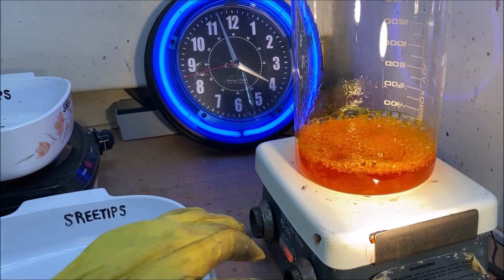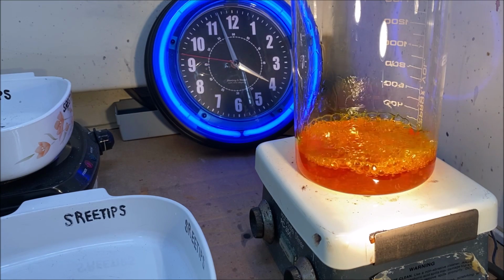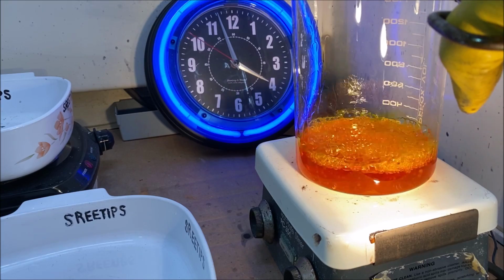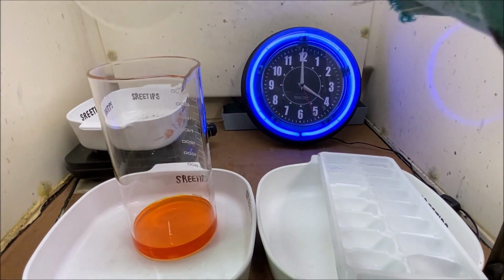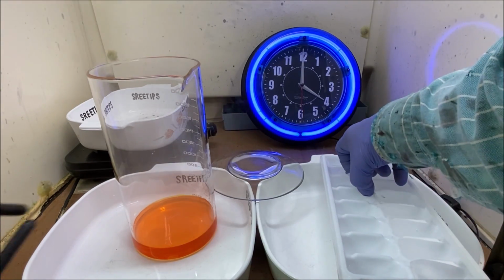Got the gold to go in solution. I've boiled it down until all the fumes have disappeared. So now what we'll do is pull it down off the heat and let it cool down. Now let's go ahead and add some ice to this. Get it cooled down so we can filter it off.